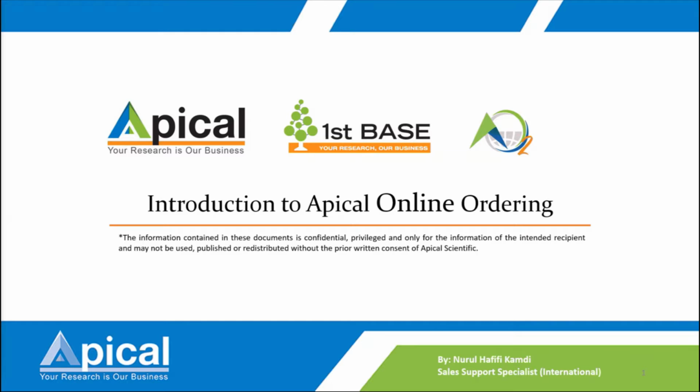As mentioned just now, for sequencing results, we recommend opening the AB1 file with our recommended software, the Sequence Scanner software. From there you can easily detect the SNP.